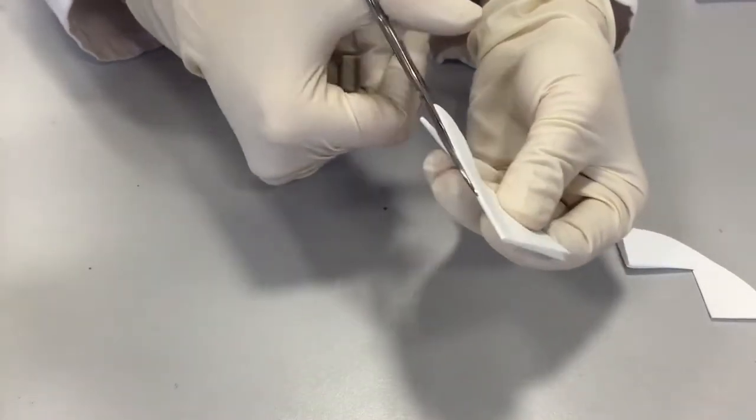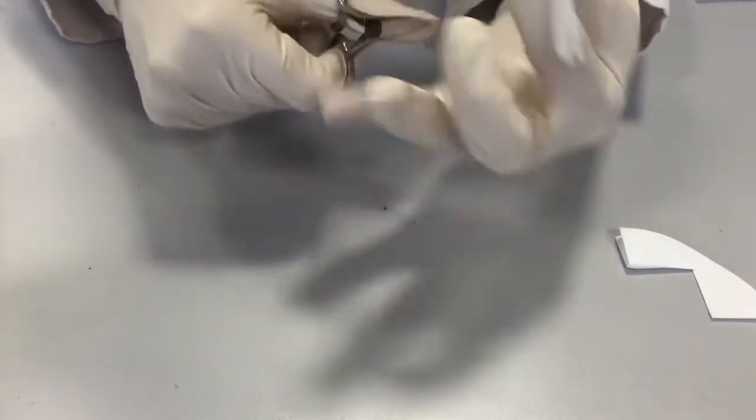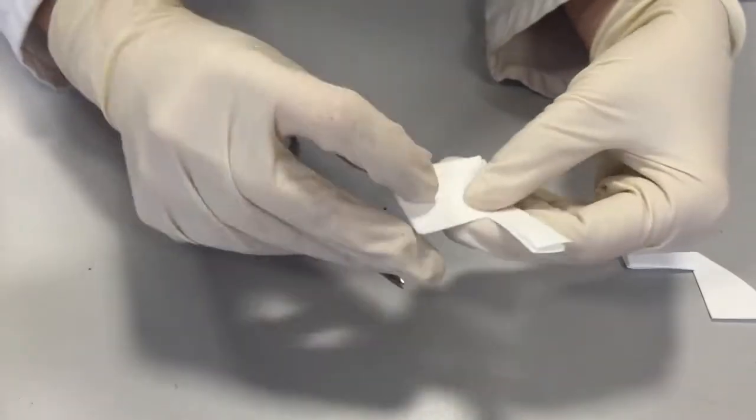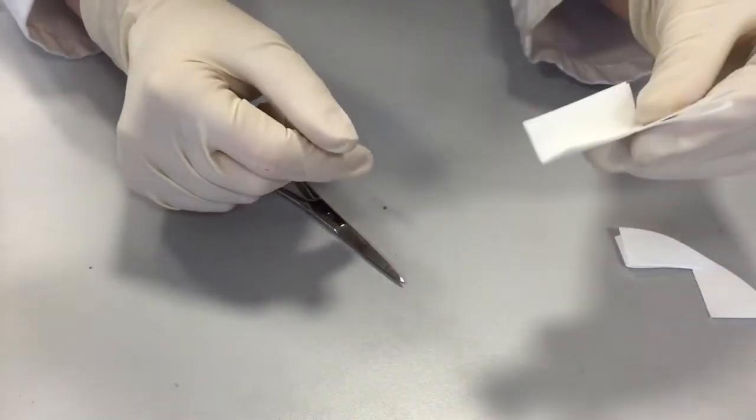You cut along the folds and then fold the filter paper so that you have your paper boat there.